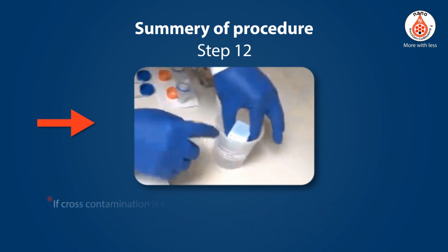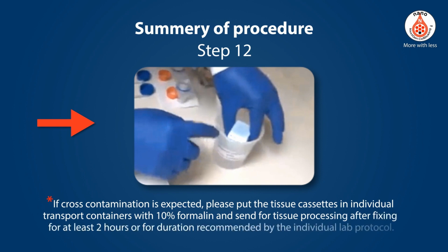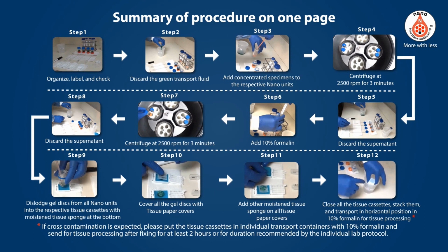If cross-contamination is expected, please put the tissue cassettes in individual transport containers, with 10% formalin, and send for tissue processing after fixing for at least 2 hours, or for the duration recommended by the individual lab protocol. Summary of procedure on one page.